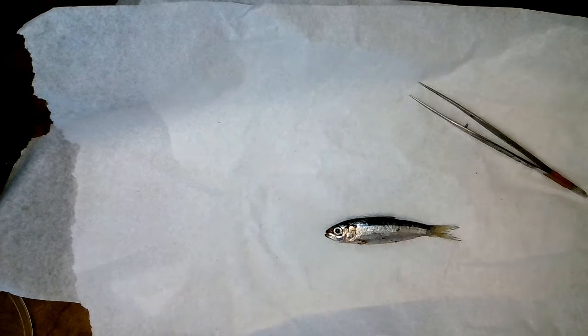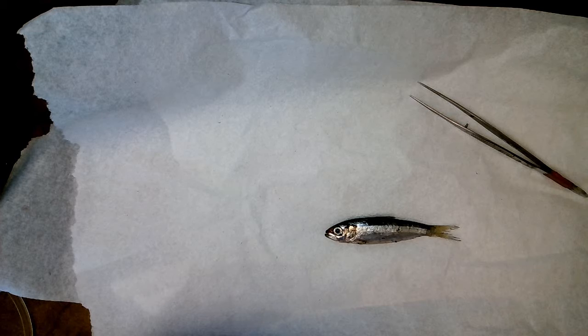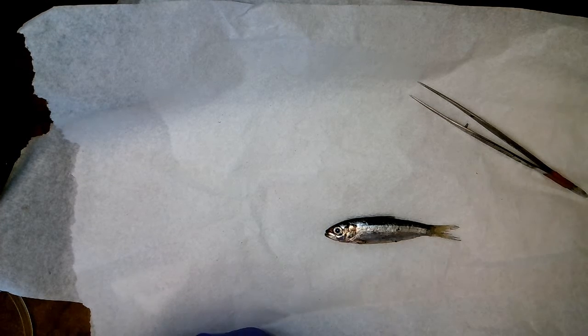Okay, everyone, we're back with the same fish from the bag of Connecticut River fish that we identified to the herring family, and now we're going to use Hartel, the key to Massachusetts herrings and shad. So I'm following along, starting on page 79 in Hartel, 2002, Keys to Massachusetts Herrings and Shad.